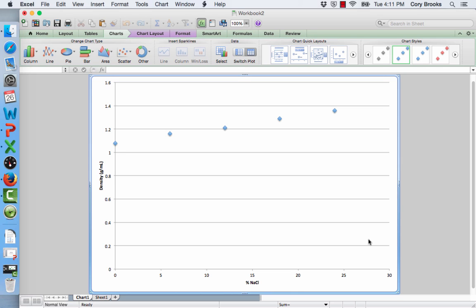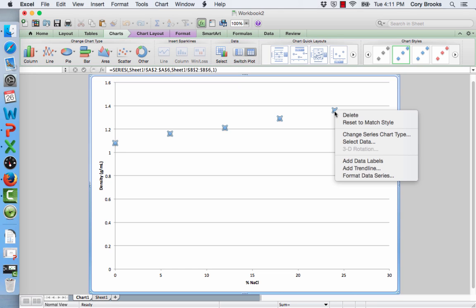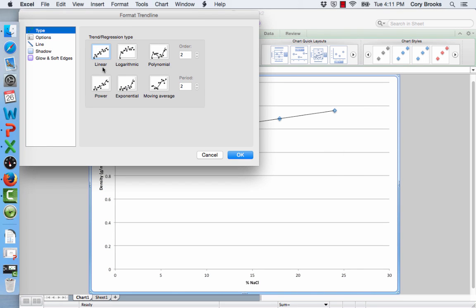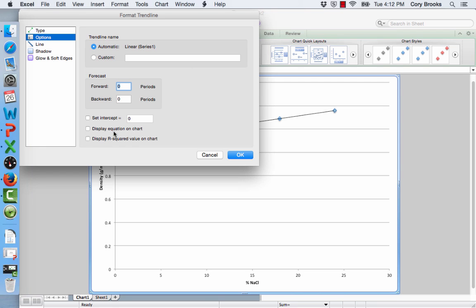So the next step is to add a best-fit line through our data points. And on Excel, a best-fit line is called the trend line. To add a trend line, move your mouse until it is hovering over one of your data points. Again, right-click or hold down Control and click and go to Add Trend Line. We expect that the density of the solution will increase linearly with percent sodium chloride. And in fact, our data points look roughly linear. So we will choose a trend line that is linear, as is the default. You should see somewhere in your dialogue box an Options tab. And under Options, we can select Display Equation on Chart so that the equation of our trend line will be clearly displayed and we can use that to determine the concentration of sodium chloride in our unknown. Click OK.